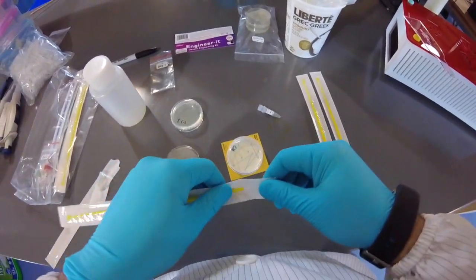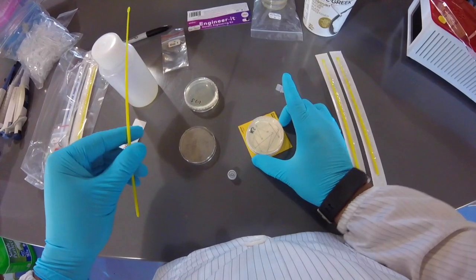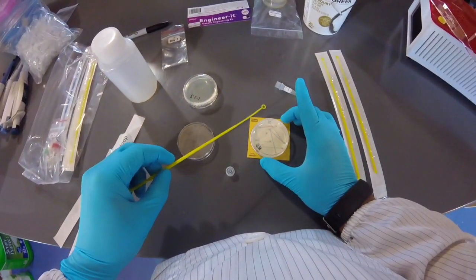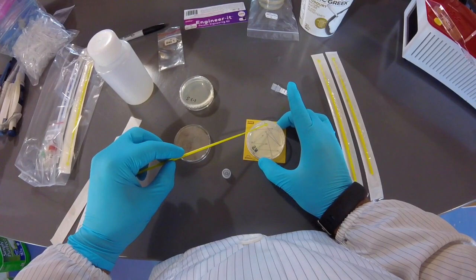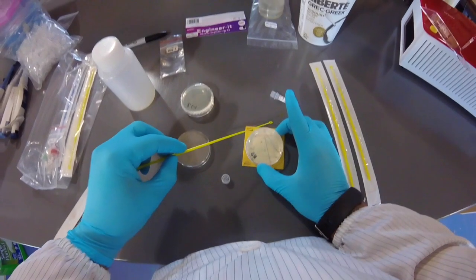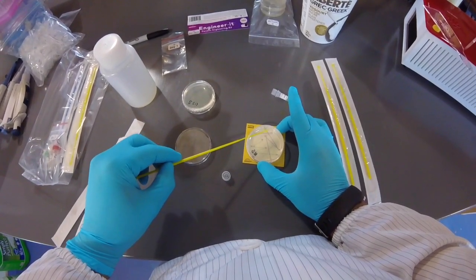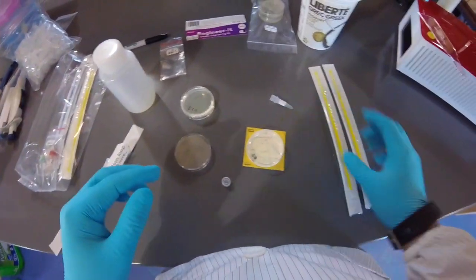I'm going to get a second loop. I'm just going to turn this a little bit, and you can either follow the line exactly, or for me, I'll drag through and I'll do a few more lines like this. Okay, so now I just dragged a little bit of bacteria in that line and spread it out over this whole area here. Now I'm going to put that in my waste container.